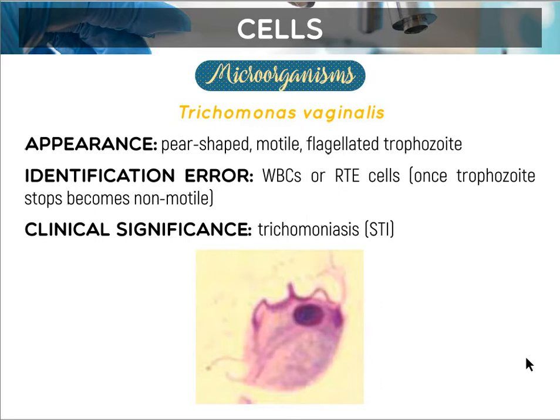One picture represents an old patient, a lolo, male, who was catheterized. So the urine I examined was from a catheter. As you can see, there is presence of infection, because when I looked under the microscope, boom, there were so many WBCs, too many, TNTC, guys. Okay? That means too numerous to count. So I could not see anything else in the microscopic field.